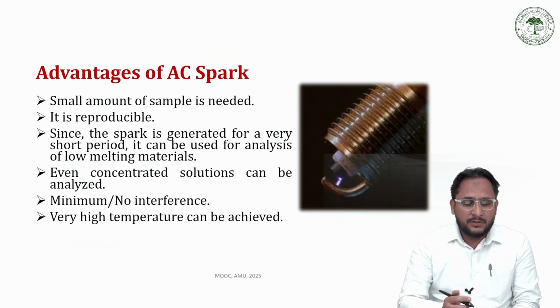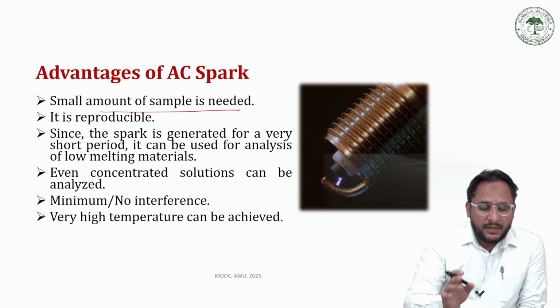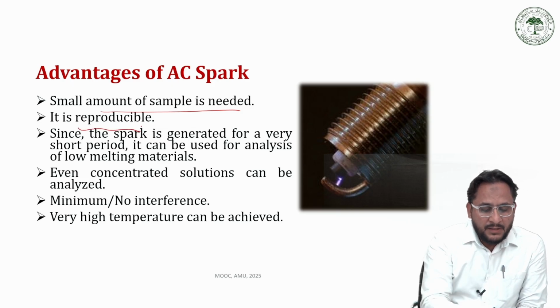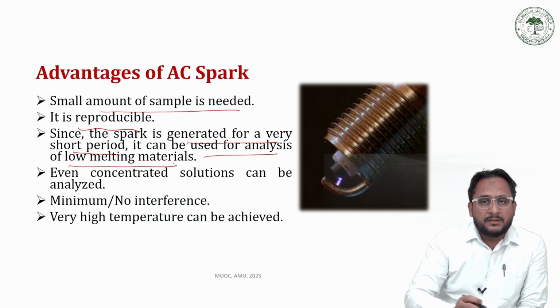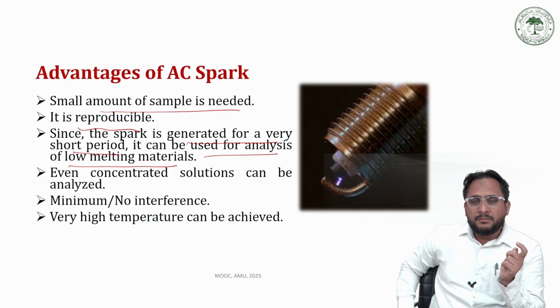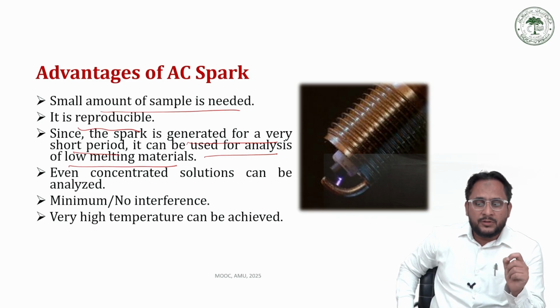These are the advantages of AC spark. Even a small amount of sample is needed. It can be used, and it is reproducible. Since the spark is generated for a very short period of time, it can be used for the analysis of low melting materials as well, because sometimes the materials melt very fast, and if the material is melted, we may have different results. So for those samples as well, we can use AC spark.